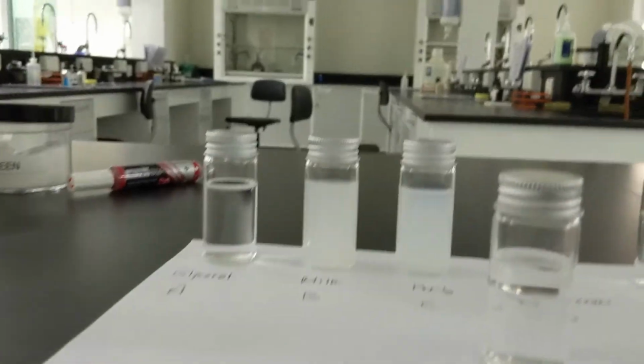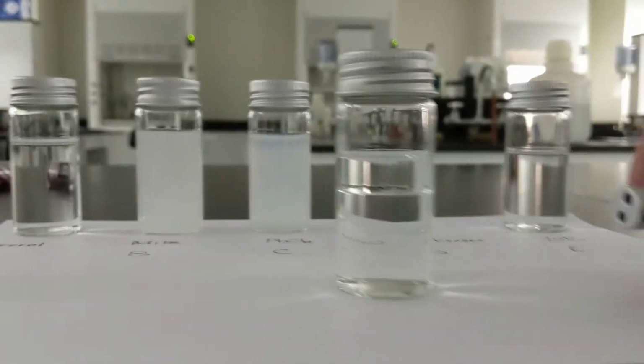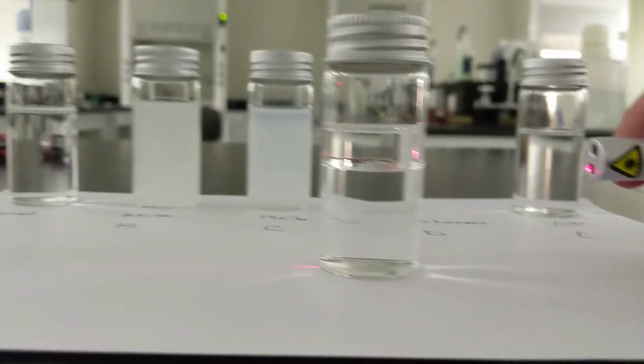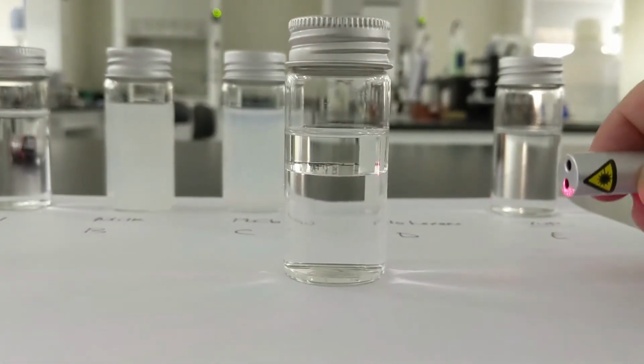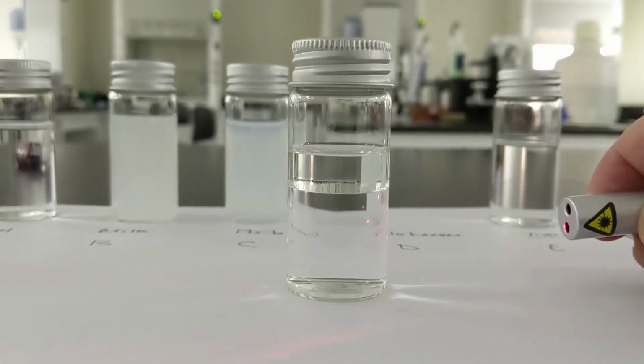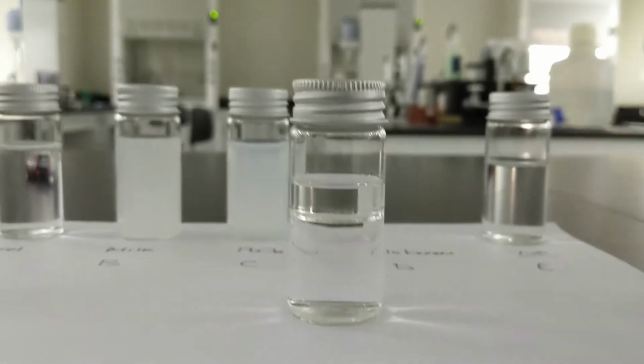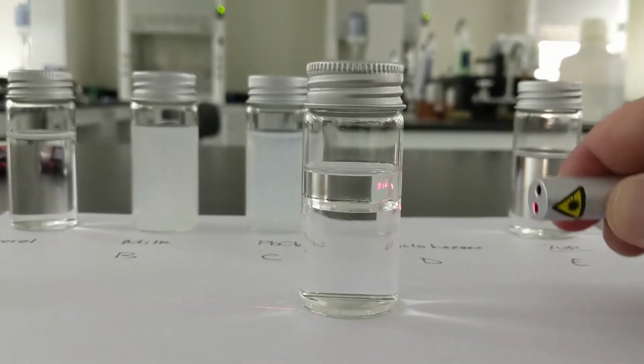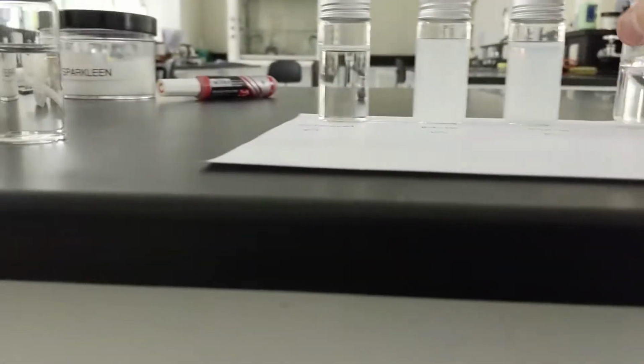Okay. Now, what about cyclohexane? Look what happened with the cyclohexane. It didn't mix. So this didn't form really any type of colloid because I'm still seeing two distinct layers. So again, I'm not getting the Tyndall effect happening with this one because they did not mix.